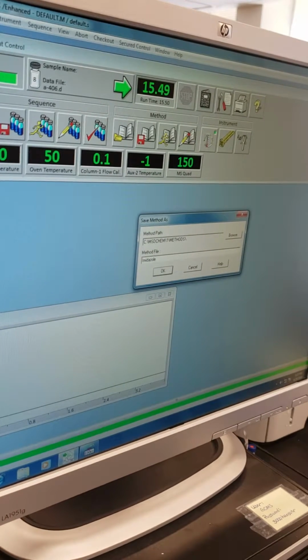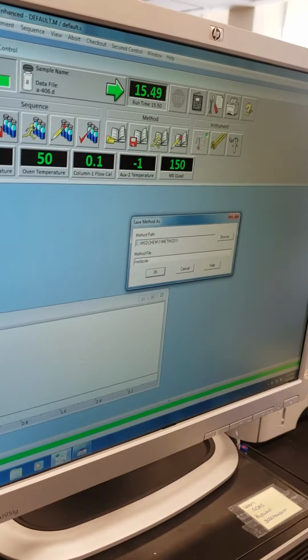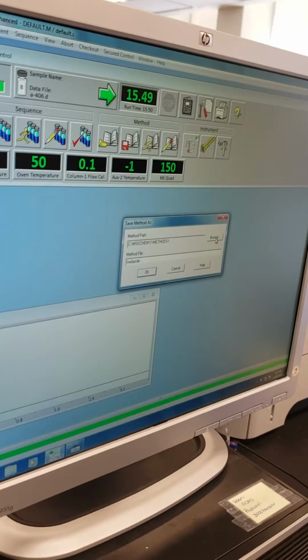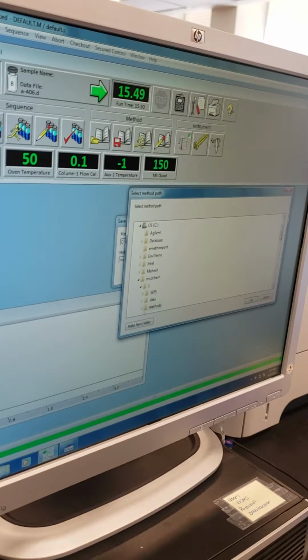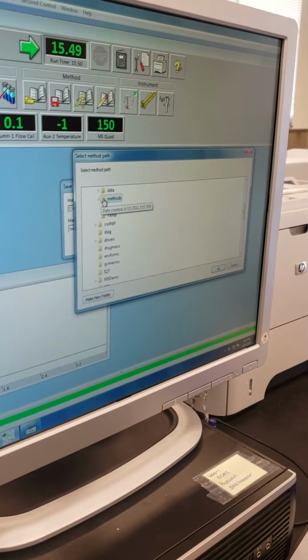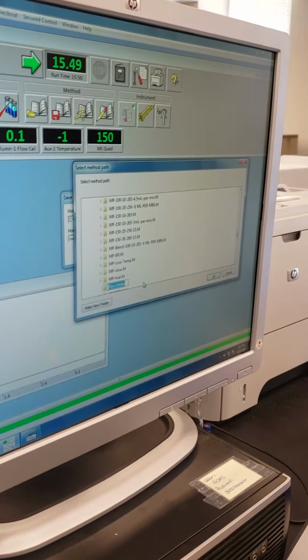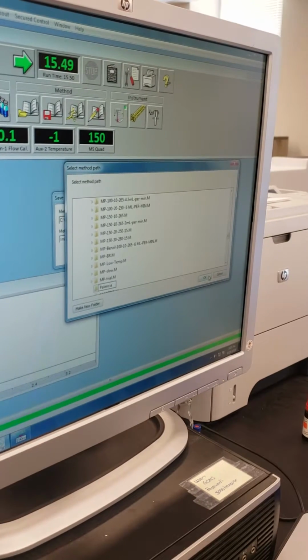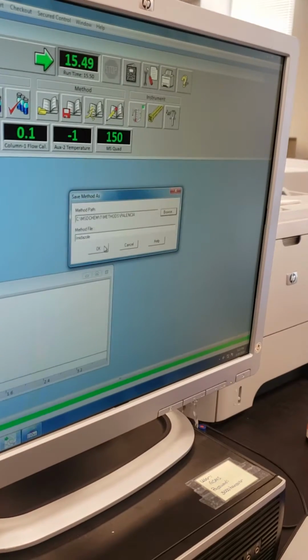The other one that I created first was my file, or a description of the method. Right, if you wanted to create a folder, we could probably browse and create one of those. Yeah, that could be good. And you want it under methods, so it's easy to find. My last name. And we save everything there. I should save it there. All right.